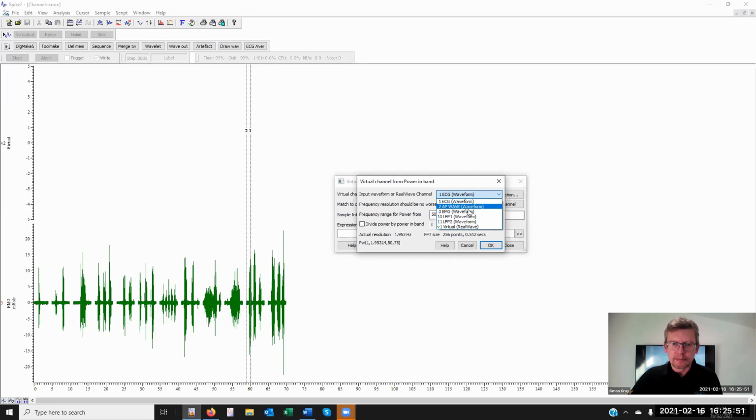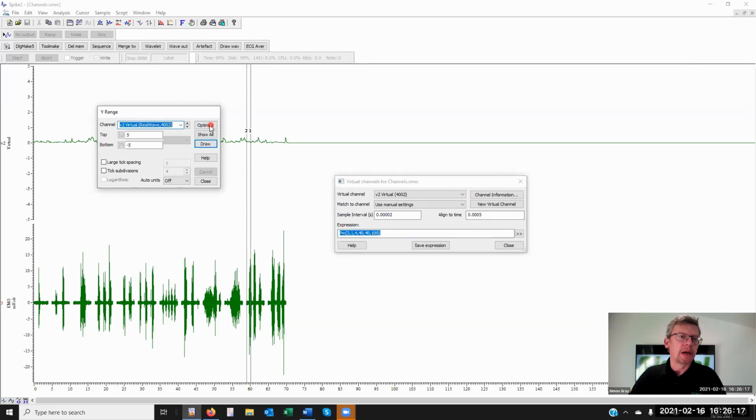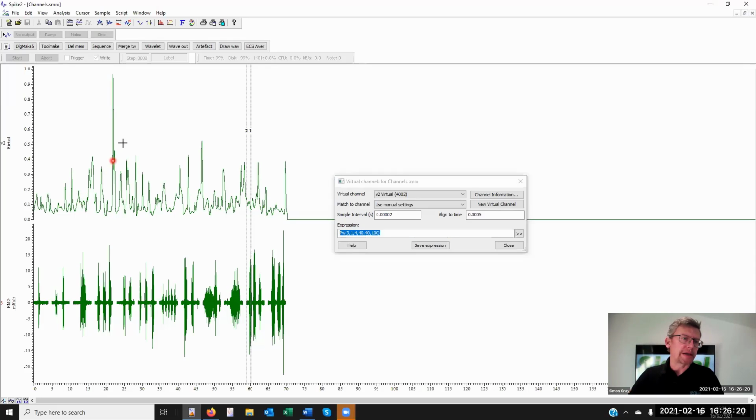Channel 3, and we're looking in the range, say 4 to, oh sorry, that should be 1 hertz as the resolution, and we may be looking for, to say 40 hertz to give me a chance with EMG, but then divide by a power, so 40 to say 100 hertz. Okay. So a ratio of power there. Once again, we have a waveform which we can use active cursors on to find times over which we go above a level, etc.